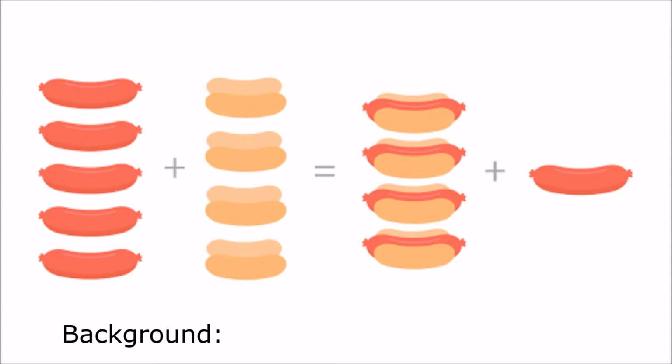Having prior knowledge of stoichiometry is important regarding this lab because limiting reactants are what determine the features of the precipitant when you make the solution.